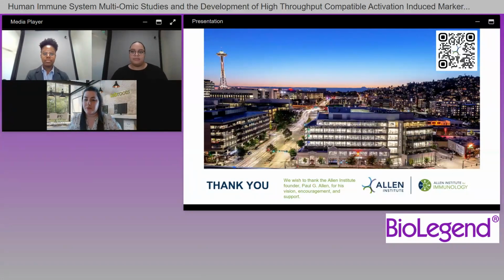Moving on to our next question here. This question asks, how do you deal with cell counting on clumped cells on the PLX? Sure, I'll take a stab at this one. So the PLX has a cell counting algorithm that is able to detect the edge of a cell, which allows it to count the majority of the cells in a clump.